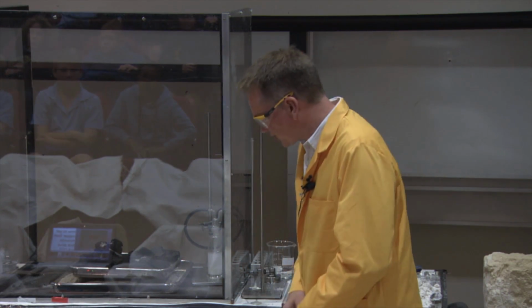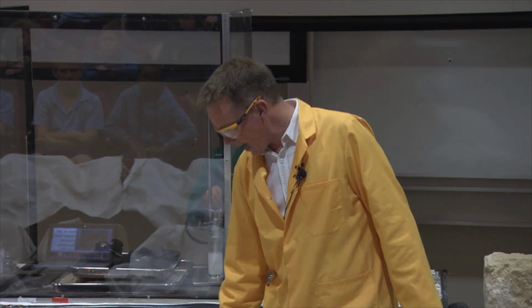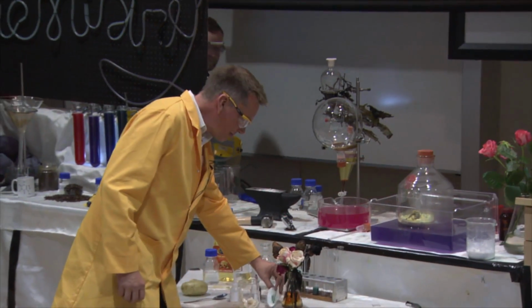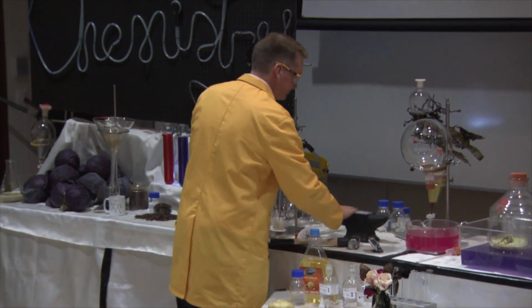Okay, so what if we wanted to get the copper out of our mineral? If this is how we normally find our copper, how can I get the metal out of it? Well, this is what I'm going to try now. See if we can get some copper out of our mineral, out of the malachite. So I've got the bits that I smashed up earlier. I just smashed them up a little bit more.